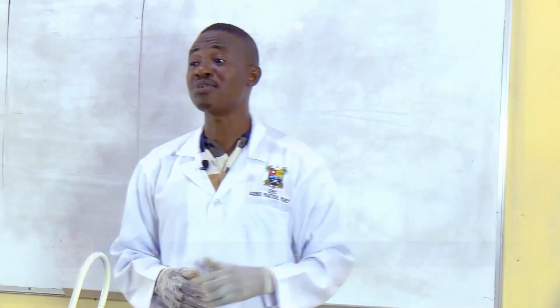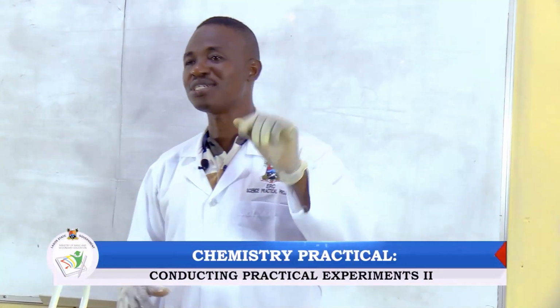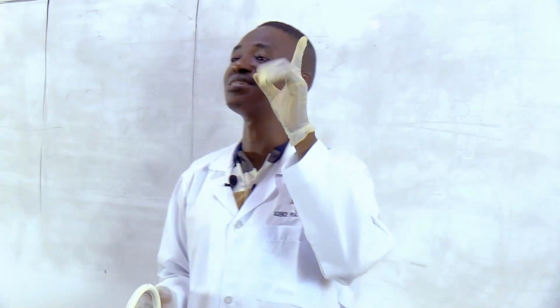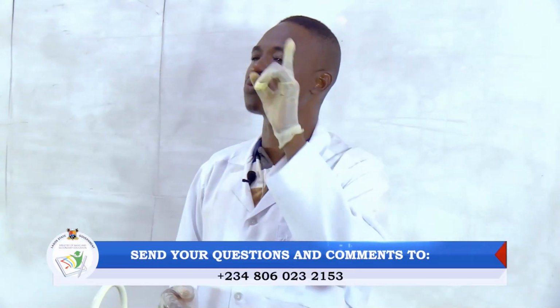So we shall continue from where we stopped in our previous lesson. Can you remind me what we did? Okay, I heard you saying test for what? Oh, somebody mentioned HCl gas. Another one said alkaline gas. Oh, correct, but you need to be more specific. Ammonia what? Gas. So we are going to continue from there.